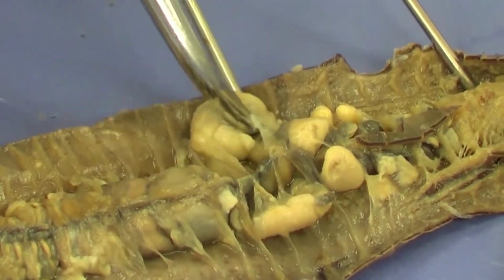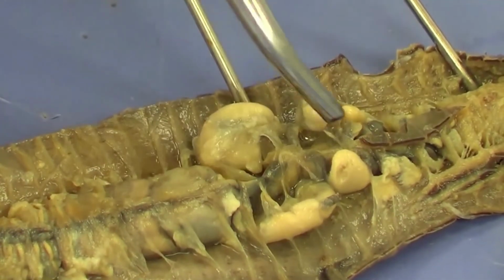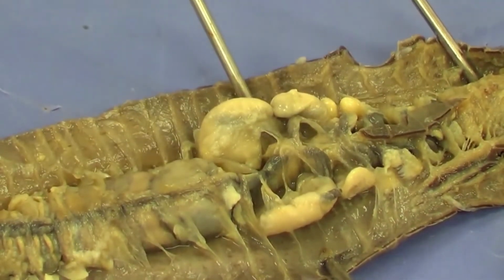Those are our seminal vesicles. And again, those are used to actually produce the sperm. I'm going to move those seminal vesicles out of the way a little bit. Those were the seminal vesicles.